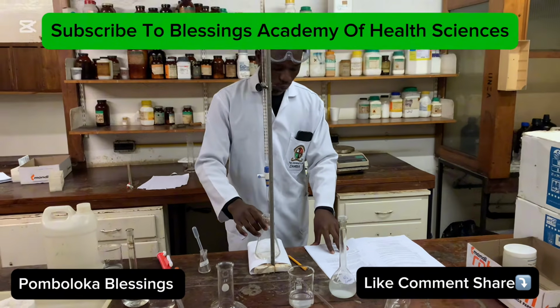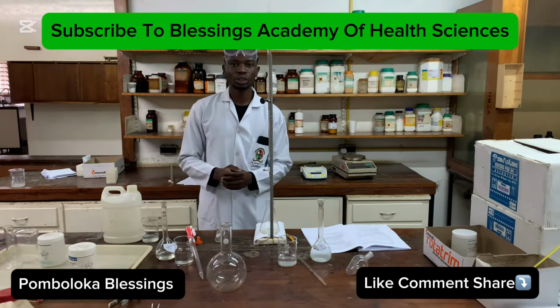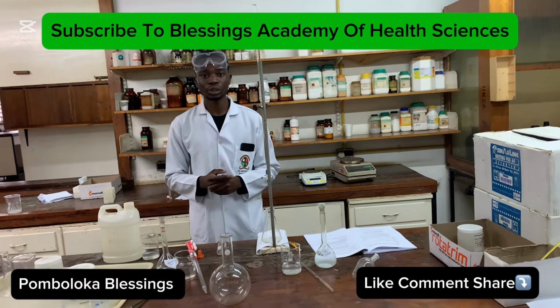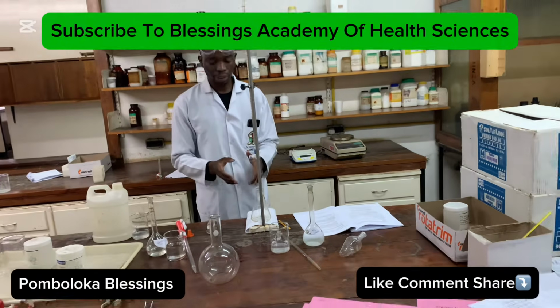All right, we're done. So the second part of the reaction that we're trying to focus on here is where we're going to add the sodium hydroxide, which is the major titrant in here. So in the burette, what we have here is sodium hydroxide. Then the sodium hydroxide is going to titrate with the what? With the HCl that is in the conical flask.